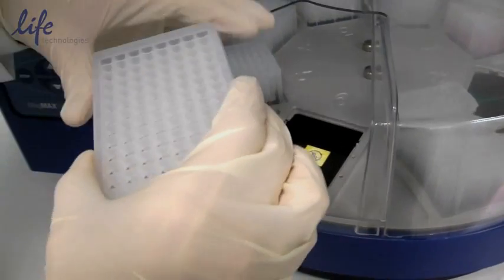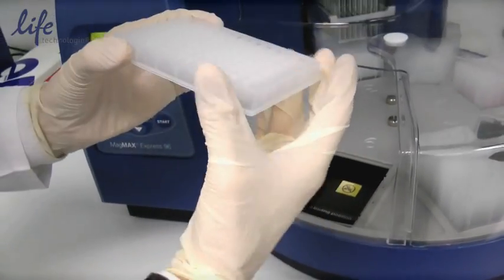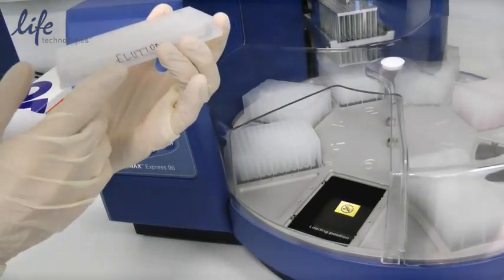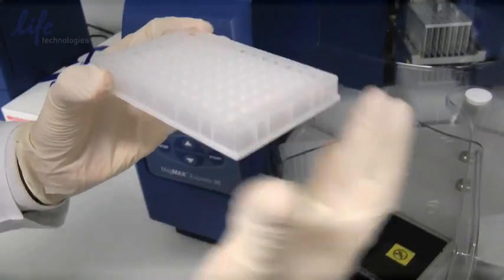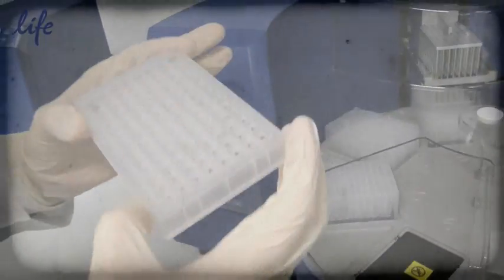So now we see the MagMax instrument delivers us the last elution plate with purified nucleic acid with the samples ready for use. The rest of the plates will be thrown away and this is the result of the run.